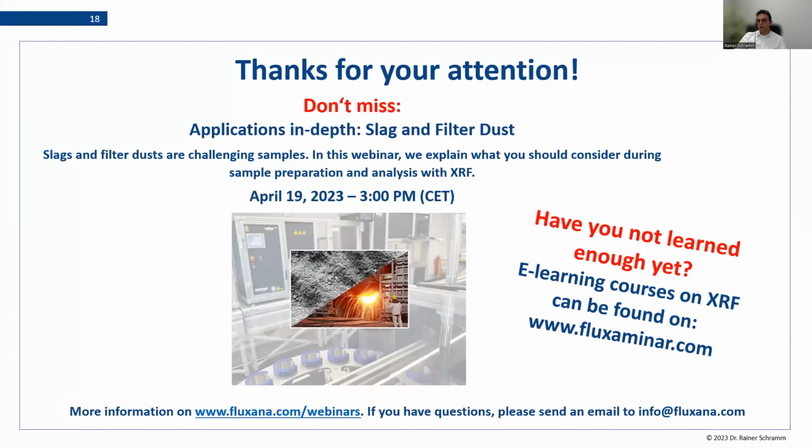The empirical calibration is always needed if one of the conditions I told you is not valid. So you have unknowns you don't know, you have particles and you don't know how they react to the result, then you need an empirical calibration.